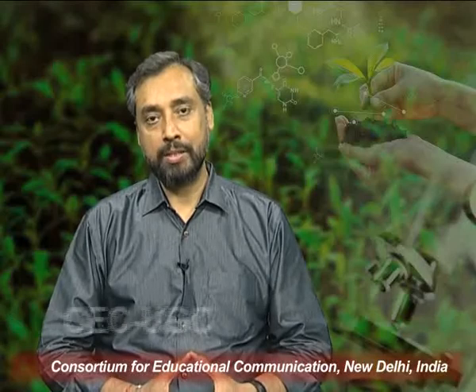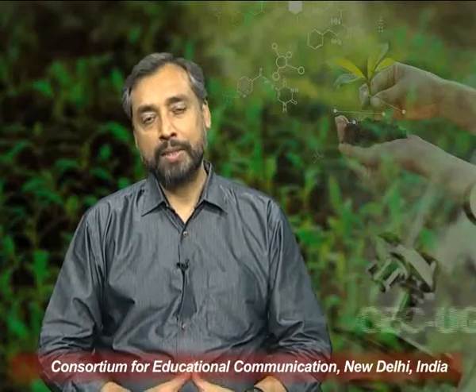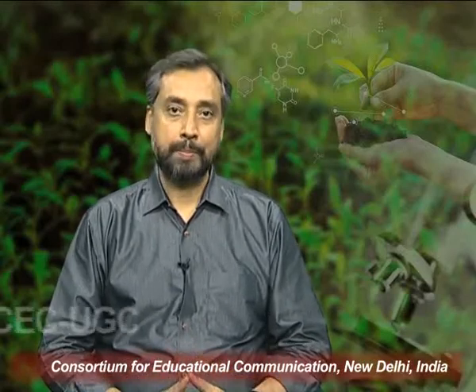In this series of lectures on various analytical techniques applied in plant sciences, we have come a long way, and till this time we have covered various principles of microscopy. Going further, we have also covered different types of microscopes, light microscopes and electron microscopes.